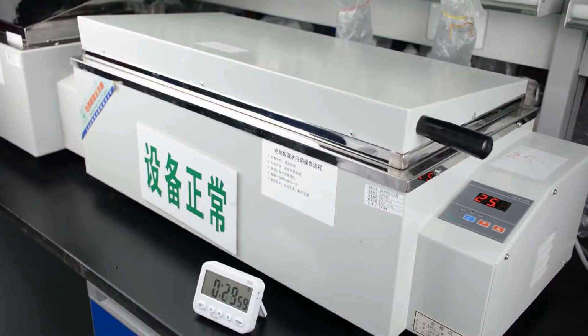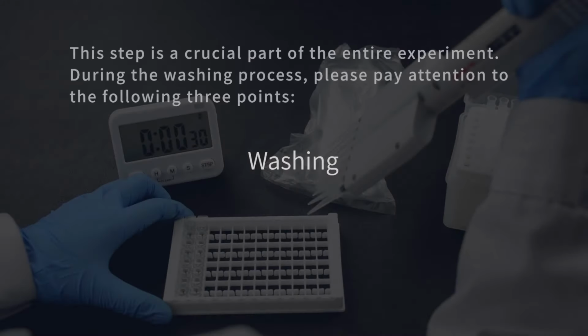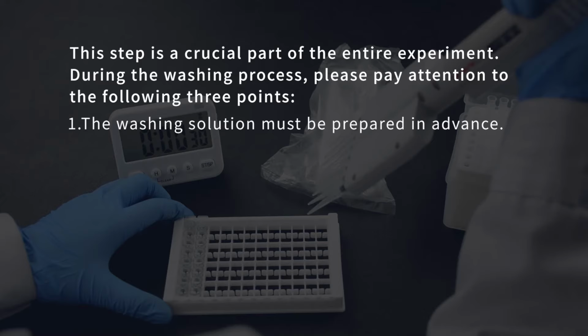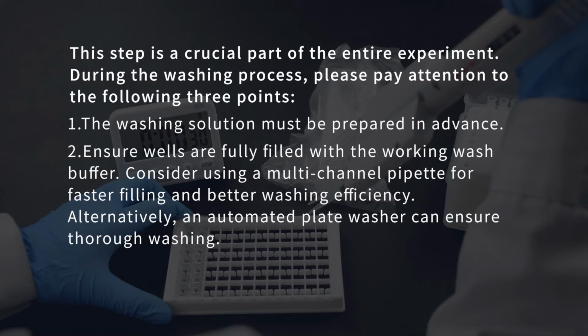Washing. This step is a crucial part of the entire experiment. During the washing process, please pay attention to the following 3 points. 1. The washing solution must be prepared in advance. 2. Ensure wells are fully filled with the working wash buffer. Consider using a multi-channel pipette for faster filling and better washing efficiency. Alternatively, an automated plate washer can ensure thorough washing.